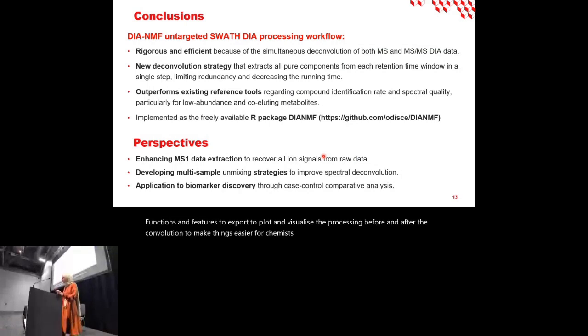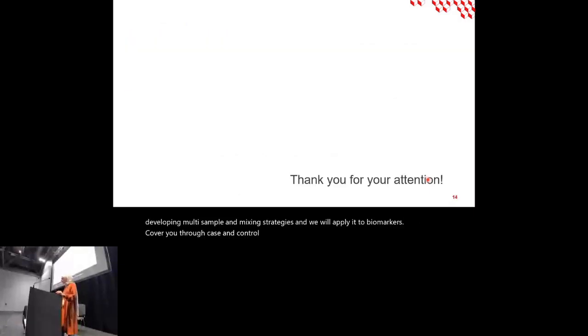As perspectives, we are working on enhancing the MS1 data extraction to recover all signals from the raw data, even if the algorithm used, such as XCMS, didn't detect them. We are able to identify them. We are developing multi-sample unmixing strategies, and we will apply it to biomarker discovery through case and control comparative analysis. And thank you for your attention.